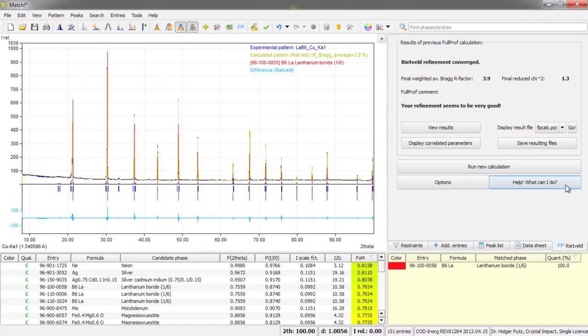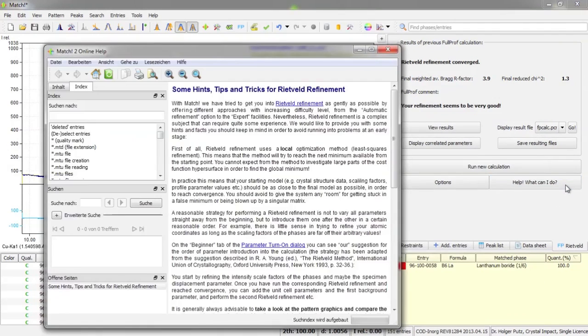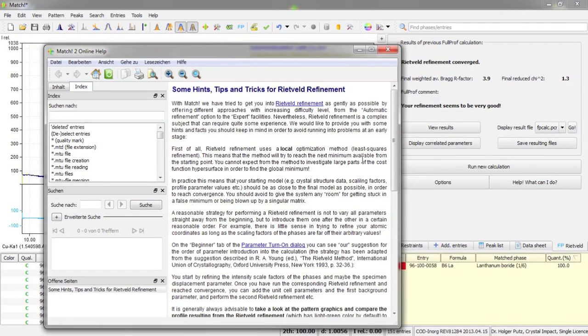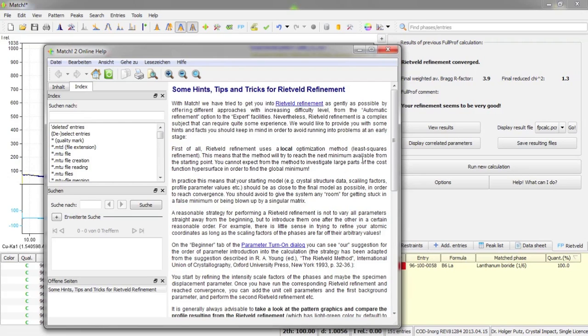And here on the bottom right hand side we now have the help button. If you press this, the online help will be displayed right at the chapter where you can read about some hints, tips and tricks for Rietveld refinement. This may be useful especially if you are new to Rietveld refinement.